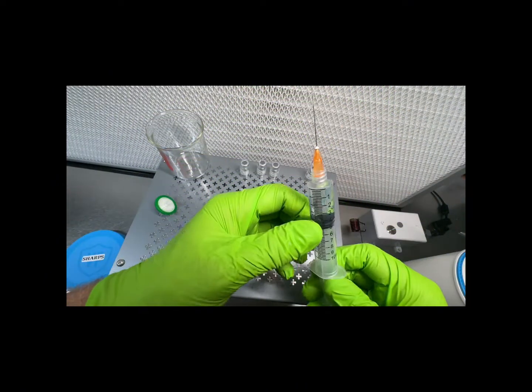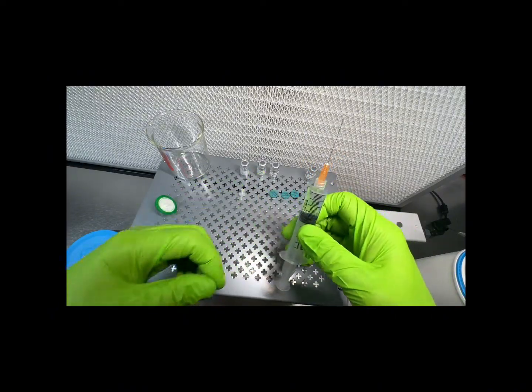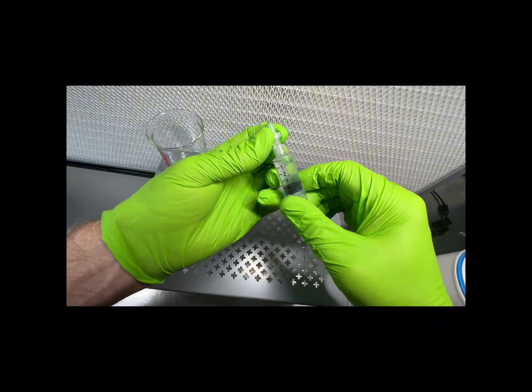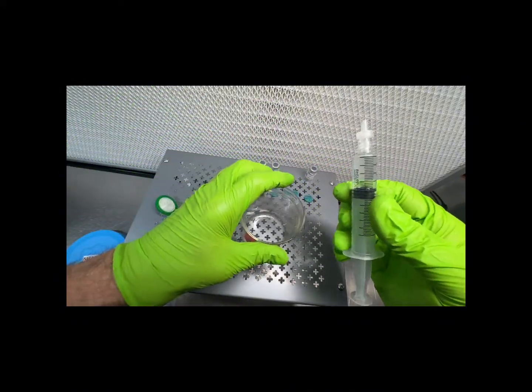All right, there we go. We're at pretty much exactly 4 milliliters. So now we'll just remove the needle. We'll put on the filter, and let's see how this does.